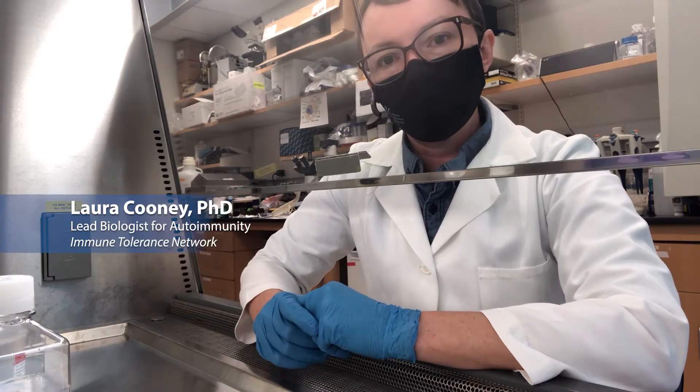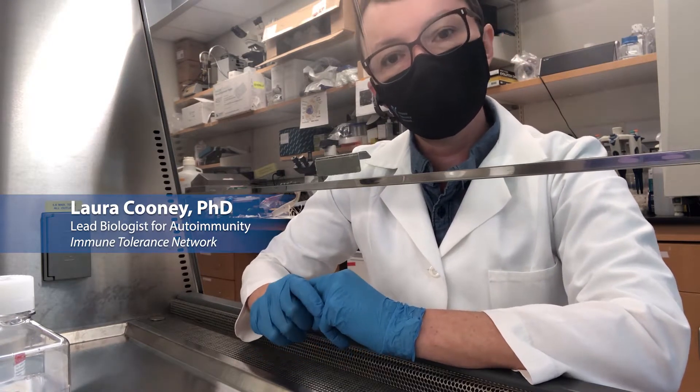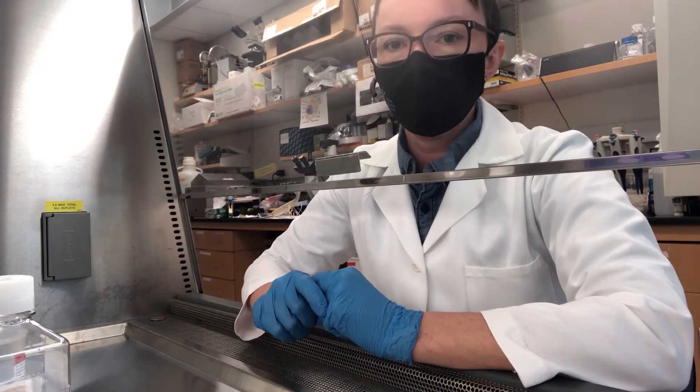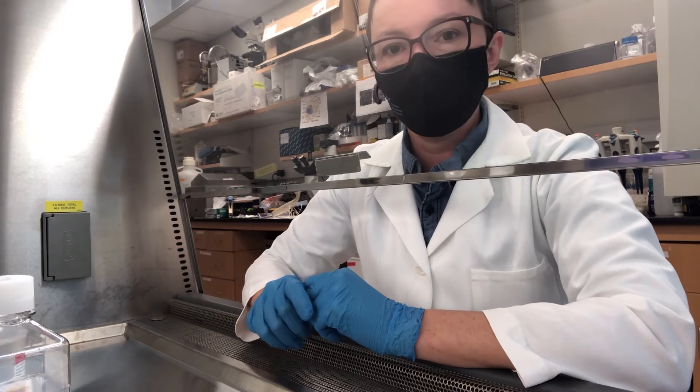Hi everyone, my name is Laura. I'm a biologist with the Immune Tolerance Network, and today I'm going to be demonstrating the procedure for separating PBMCs from whole blood. We're going to be using SepMate tubes.